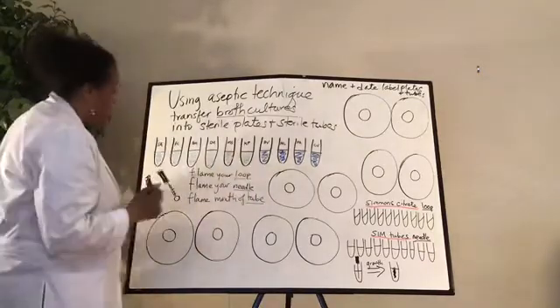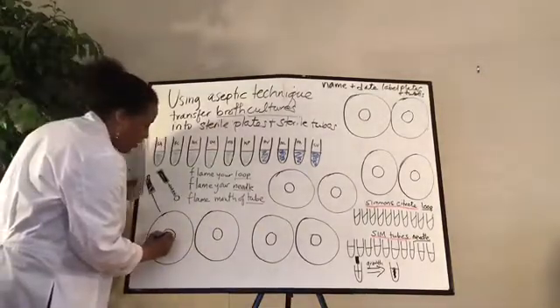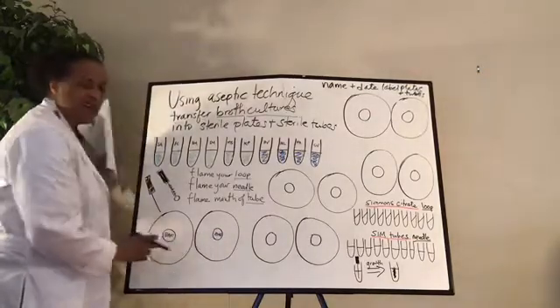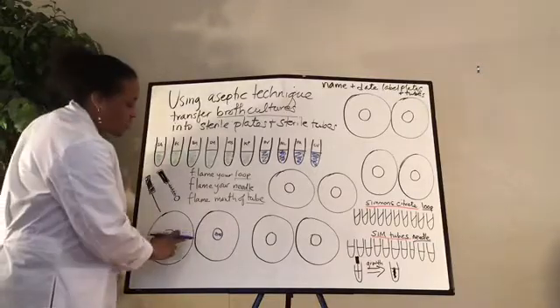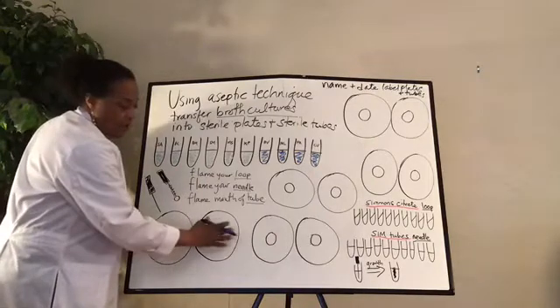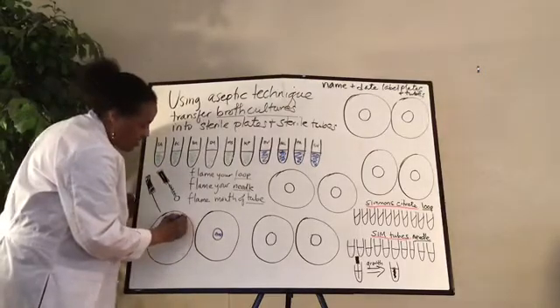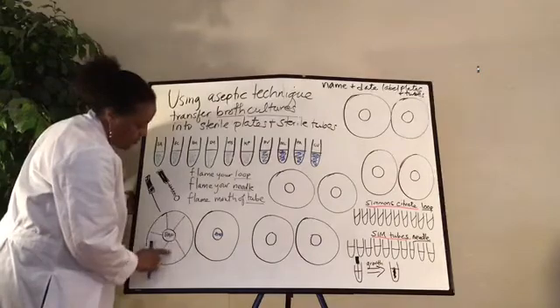So how are we going to take 10 bacteria and put them into all of these? That's a good question. The first plate that we will use will be the blood agar. So I've drawn it like this so I can put BAP here. And then it's 2 blood agar plates, because 10 bacteria on one plate is going to overgrow the plate. Everything will be contaminated. So I got 2 plates, and I'm going to divide it into 5. 5 bacteria will go to this blood agar plate. 5 bacteria will go on this blood agar plate. Then that means all 10 bacteria will have been placed on the plates. So just draw some spokes to a wheel like this to make 5 places. 1, 2, 3, 4, 5.